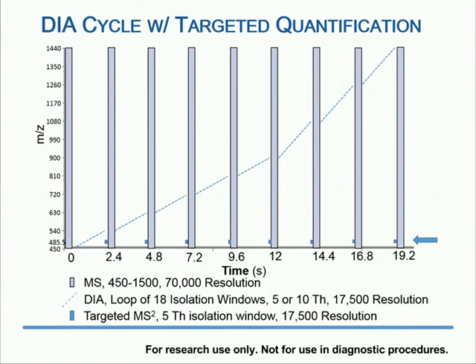The reason we've had to do this is that there was one inclusion list for this whole experiment. If we had separate inclusion lists for the DIA and for targeted MS2 where you could set very specific times, we could avoid this. So please lobby Thermo for that capability. Otherwise, you could use segments and make a very, very complex program, but this was just something that we wanted to try very quickly to insert a single targeted MS2 into every cycle.